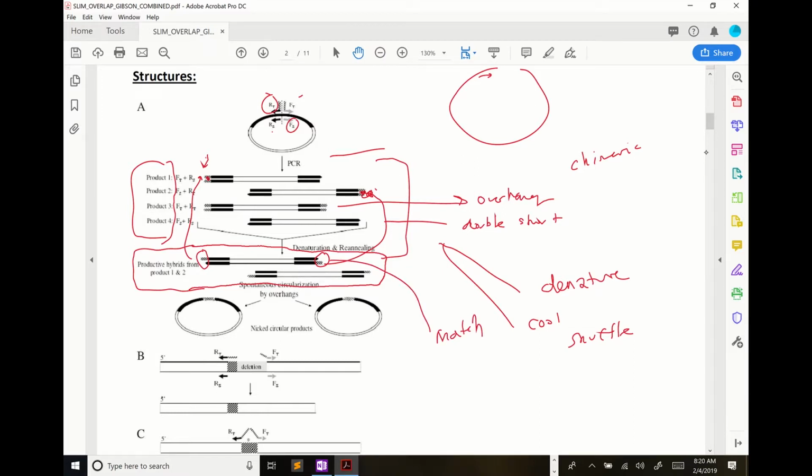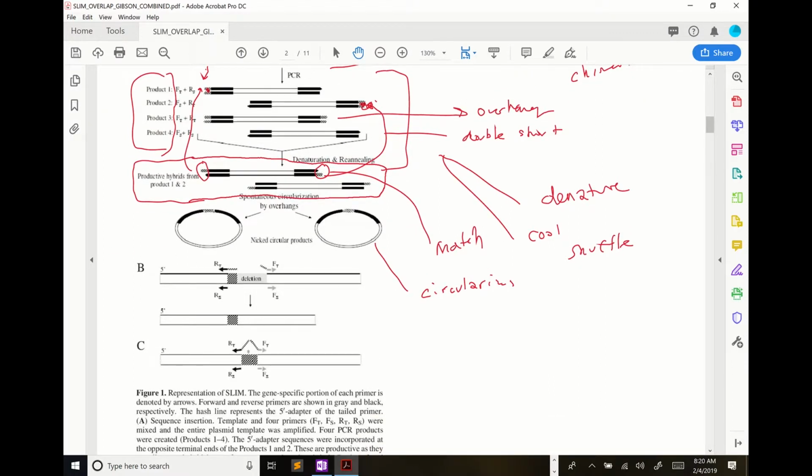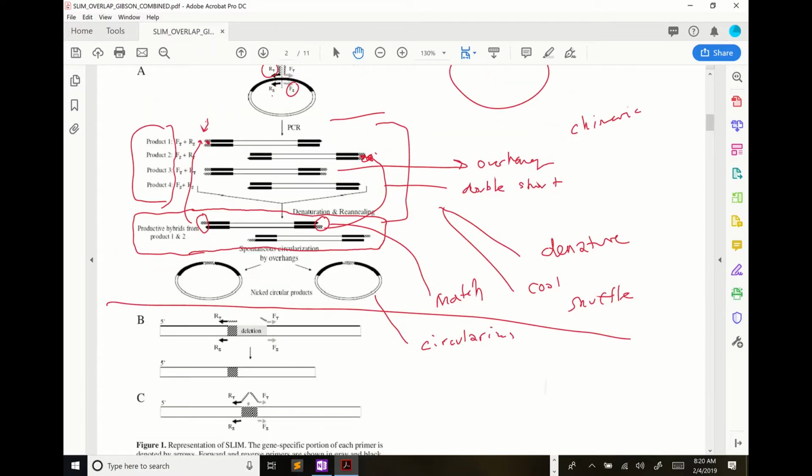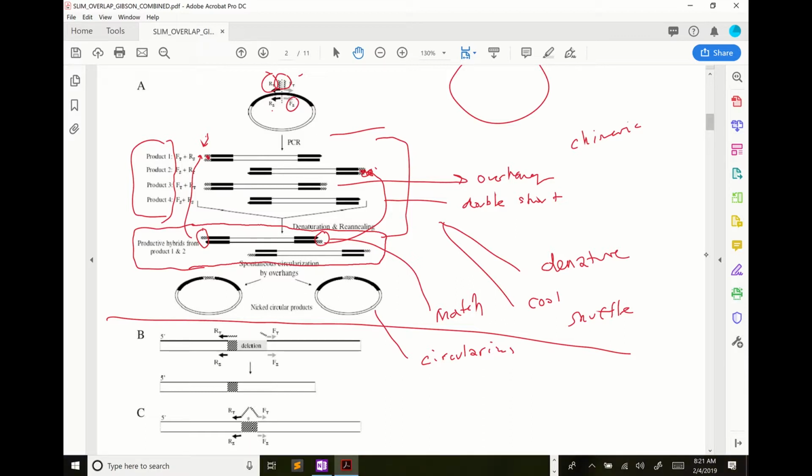So now the plasmid circularizes, because those sticky ends just bind to each other. Does that make sense? You produce this plasmid by PCRing all the way around the plasmid, and the sticky ends match, and so it can circularize, okay? So this is how you would do an insertion. In this case, they're showing you an insertion, and what gets inserted is whatever you make up to be the matching overhang. That will get inserted right there into your plasmid, okay?